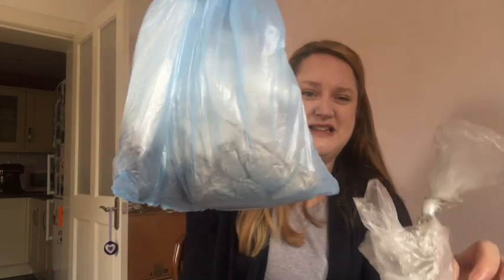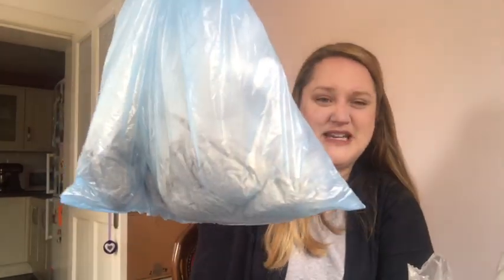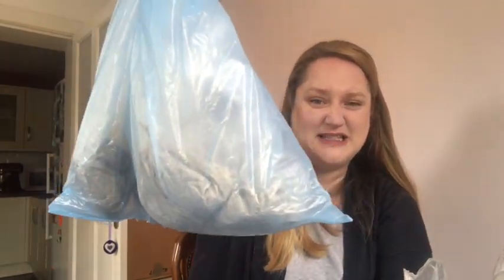Hello! So these are our soil samples. I've got two very different bags. This was from the marshland, and you can see it's kind of browny. It's got some bits of vegetation in there too. And that is from the sand dunes. You can see it's a lot sandier. Go for this one first of all.